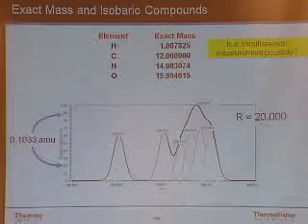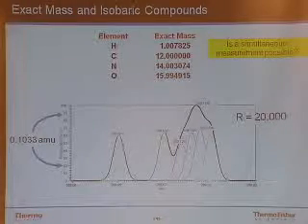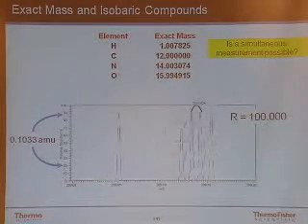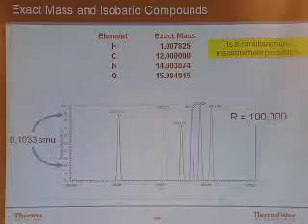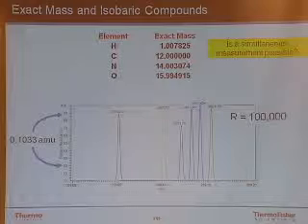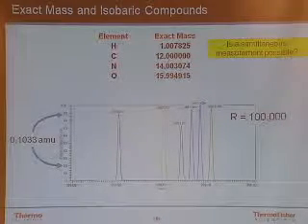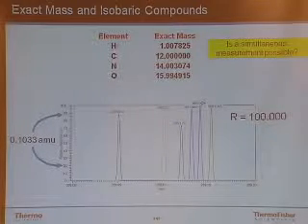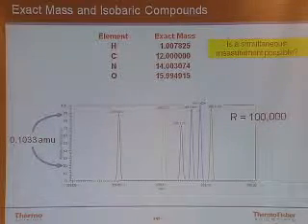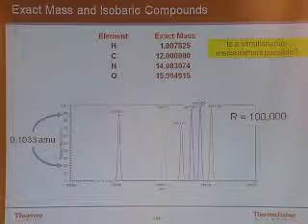But again, I can't distinguish all those pesticides because the spectroscopic resolution is not high enough. Now, if I go to 100,000 resolution, which is available only through this Exactive mass spectrometer, then in fact I can identify all 8 pesticides, even though they all have the same nominal molecular weight. They have the same nominal molecular weight, but different exact molecular weights.